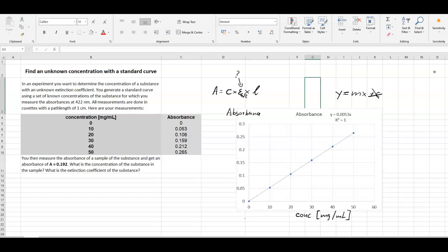Okay, now with this very good trend line or line of best fit, and we know it's a very good line because this R square value is equal to 1, which means it's a perfect fit, we can now use our absorbance that we measured for the unknown concentration. So here, the unknown concentration had an absorbance of 0.192.